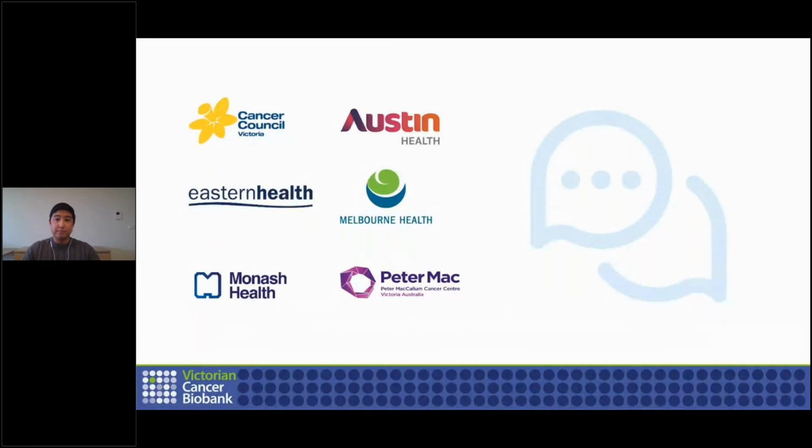So now there are a few more questions. One from Tim asking, can you describe the level of integration OpenSpecimen has with consortium members' LIS systems? I think the answer in terms of VCB was that they don't really integrate with the consortium members' LIS systems. But in general, OpenSpecimen is 100% REST API based, which in layman terms means that you can easily integrate it with any other external systems. We do have standard integrations with REDCap, OpenClinica, Epic, etc., and it can also be done easily with other custom LIS or internal clinical databases.